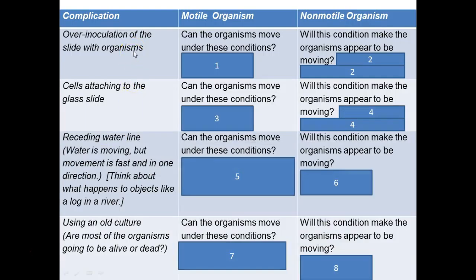What are some complications that we run into and how does this affect our results? If we have a known motile organism and we over-inoculate them on the slide, can the organisms move under those crowded conditions? If they're crowded, they're not going to move as well as we would like. It would be really difficult to see that motility.